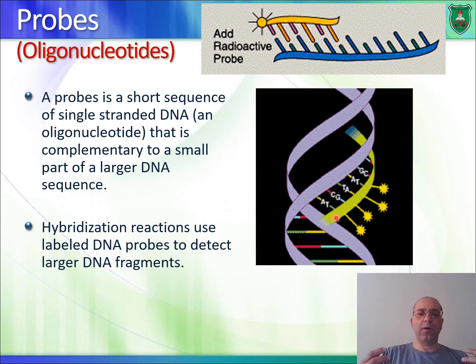Okay, so there are many more probe molecules compared to the original DNA strand, what we call the template. That is the copy or the DNA strand that I'm testing. And because of that, there is competition. Remember that hydrogen bonding is non-covalent, so it's reversible. Sometimes you can have hydrogen bonding between two molecules, but it's reversible. So if you add a probe, there would be competition between the probe and the DNA template.